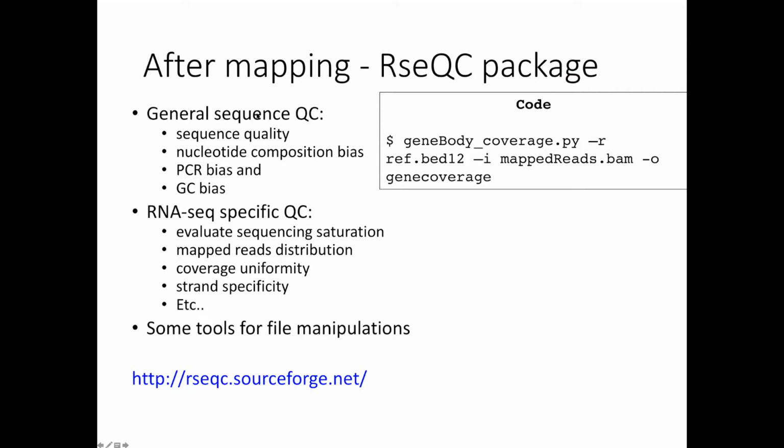The difference is that when you did it the previous time, you were doing it on all the reads, whereas this information is now only on the reads that actually mapped to the genome. So there's a small difference here in which reads are being represented.